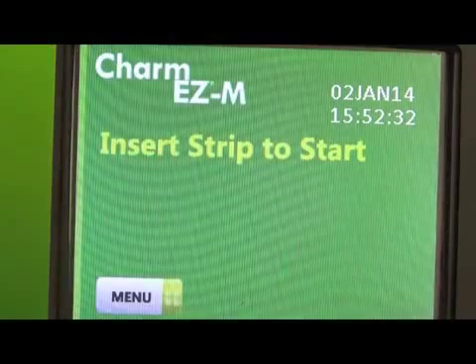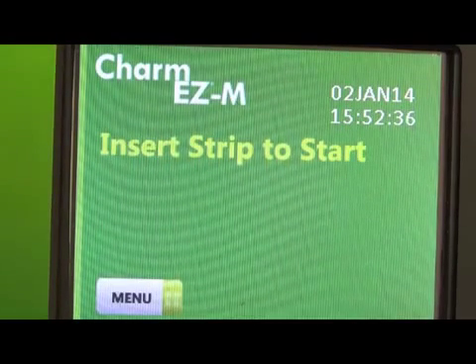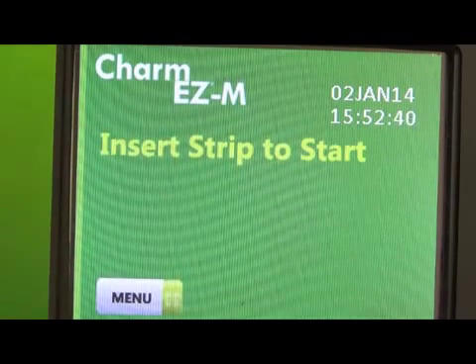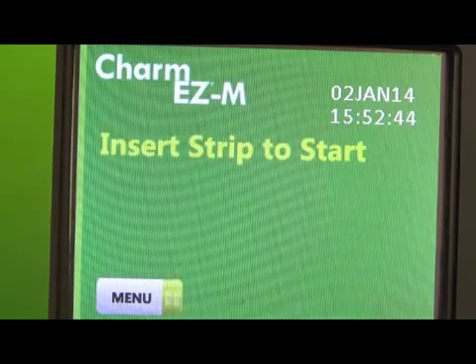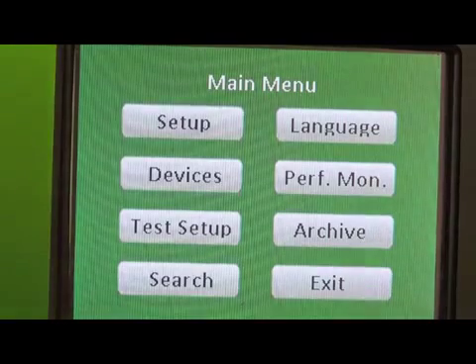This video will review how to set up a different Rosa mycotoxin channel on the EZM reader and how to assign associated commodities for that test. First thing you'll need to do is press the menu key from the main screen on the EZM reader.